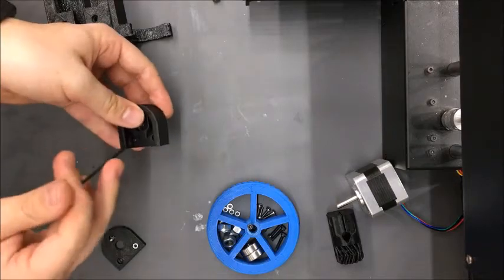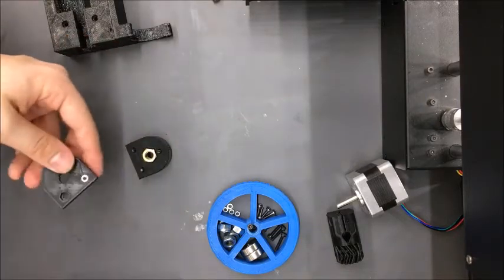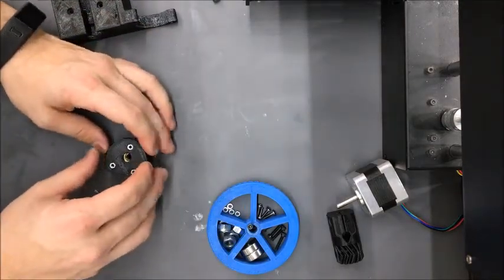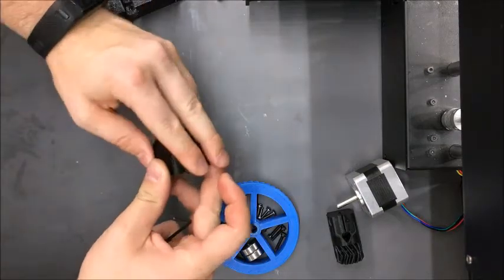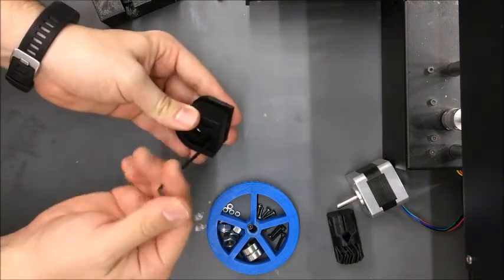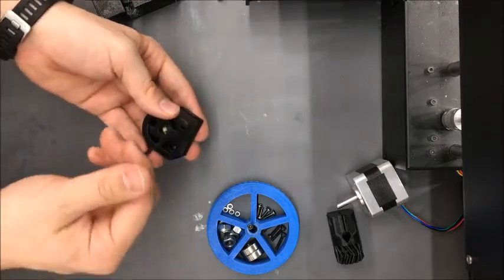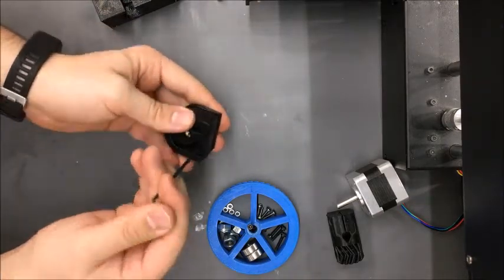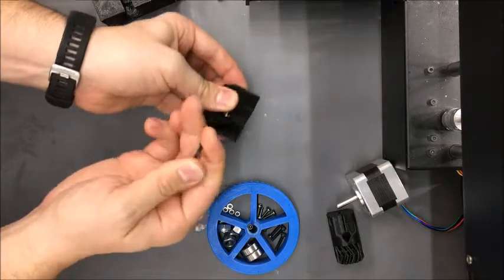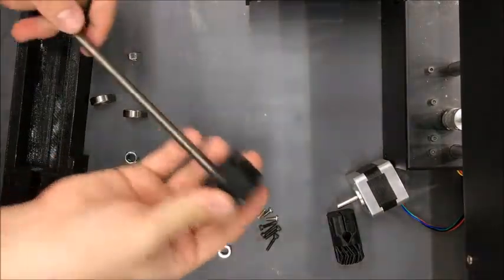The bolts might be a little difficult to push in, but get them all the way down. Then turn this upside down, put three M3 hex bolts into the plate, and bring the piece together. Start tightening — you just need to get a basic engagement between the bolts and the nuts. It may take a couple of tries to get that engagement. All right, so this is together.